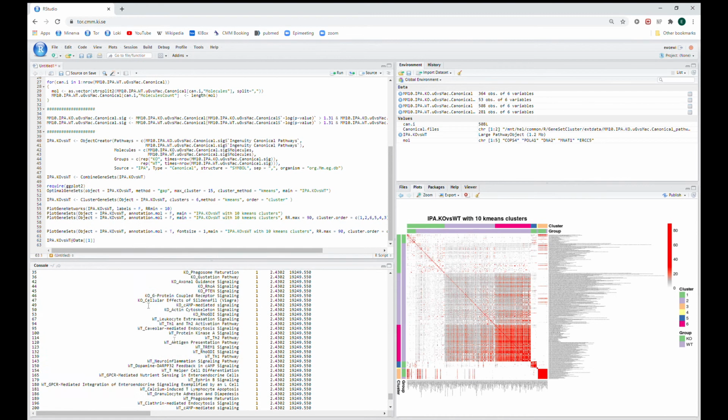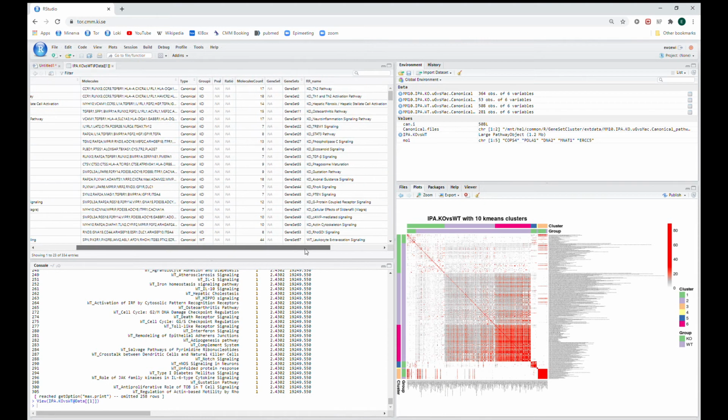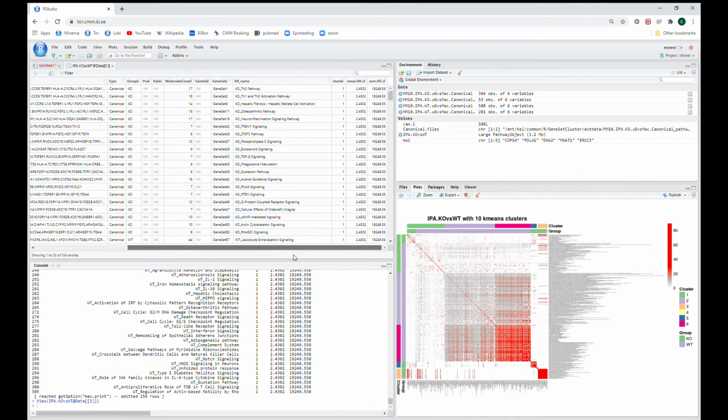And then we can see everything. Or to make it easier, we can put it in the view. And this is what it looks like, our final data. So again, when we load things this way, there's not a standard p-value. We can assign it if we want, but it doesn't use it. It's more for selecting the pathways we want to take along.